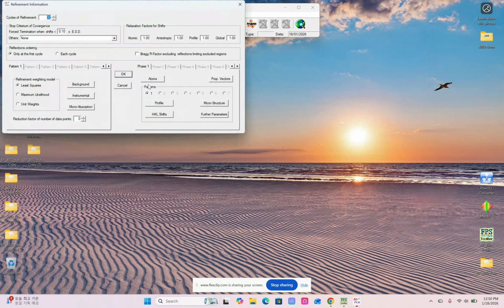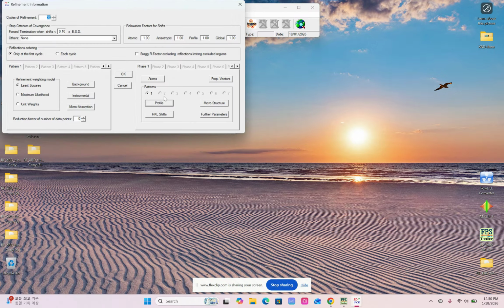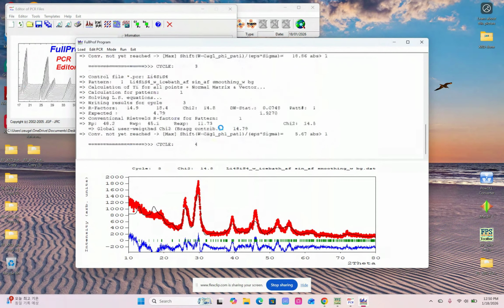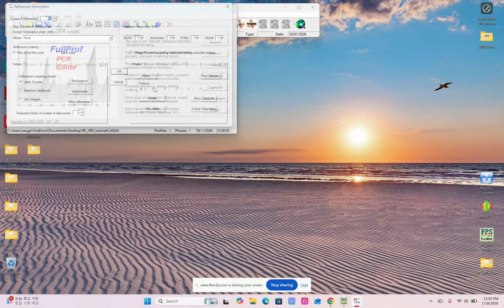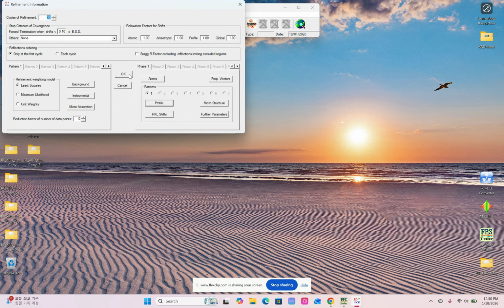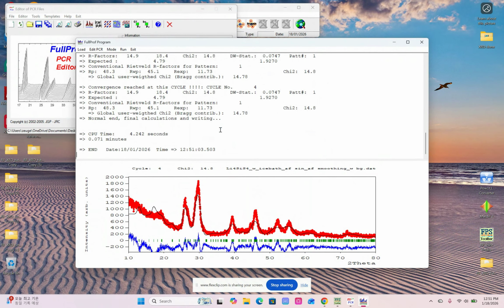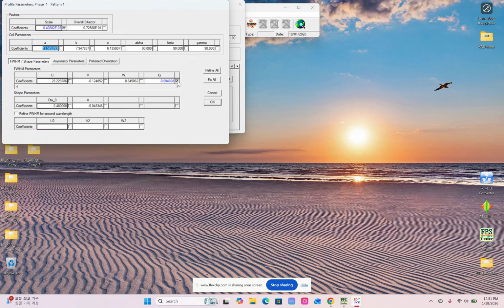Good. Okay, let's risk it to do the last one.